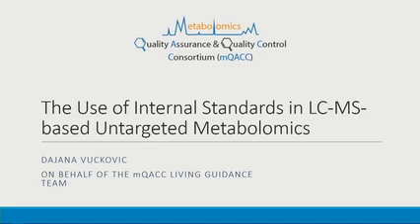Hello. Maybe I missed it, but do you also have some guidelines regarding reference materials to use? Because I saw a lot of QC stuff for this in the sequence, but if I want to know if my method actually works for what I'm interested in, I would have to compare to other labs, right? I can only do that with some kind of reference material.